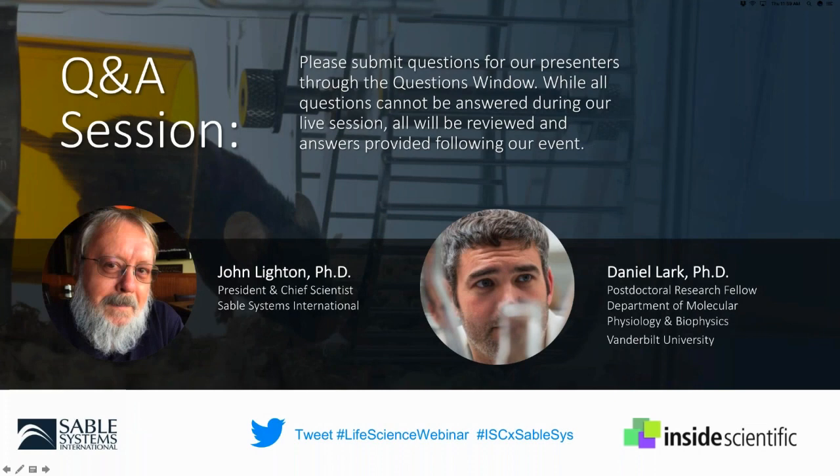So, John, this question is for you. Do you need to use the behavioral analysis system in conjunction with metabolic measurement? Sorry, you asked if the behavioral system is in conjunction with metabolic measurement? Yeah, the two of them occur simultaneously. So pretty much you have synchronized behavior and metabolic information. However, you can have the system for behavior without doing the metabolic analysis at all, if you wish. And so if the metabolic information, the energy expenditure, is not of interest for the research questions you're asking, you can simply get the system without the metabolic measurement, which means it's a good deal simpler to operate. Excellent. And a lot less expensive.